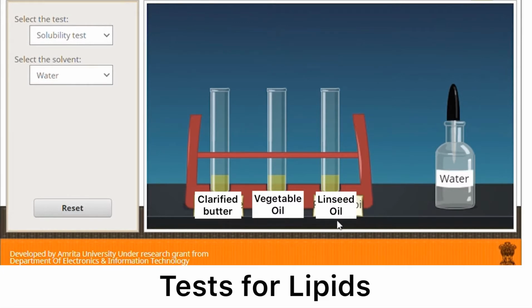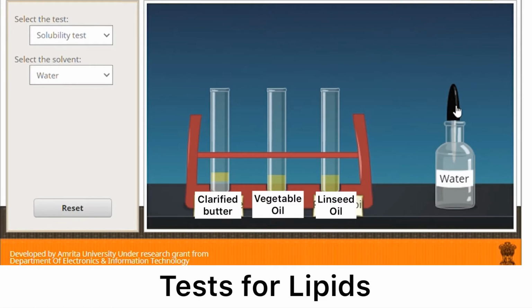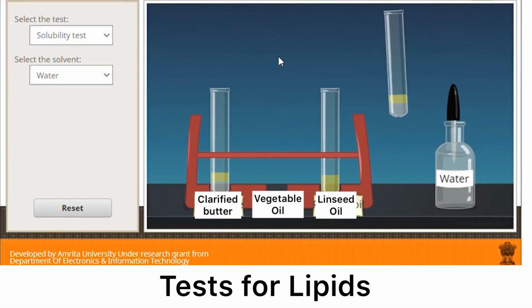And for our first solvent, we will be using water. Now that we have the setup ready, we will be adding about 5 ml of our solvent in each of the test tubes and mix. Observe what happens after the addition of water to each of the oil or fat samples. Record your observations. You will need this later when you answer the laboratory report sheet.